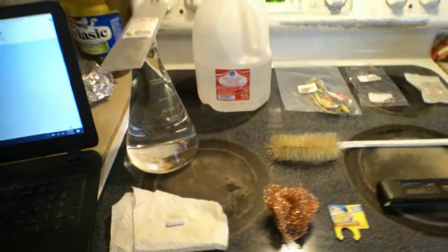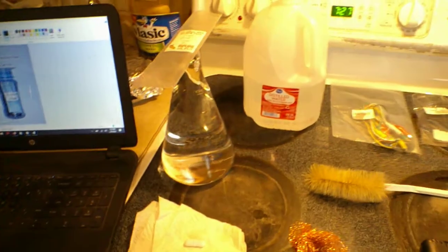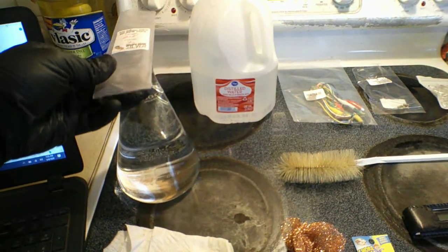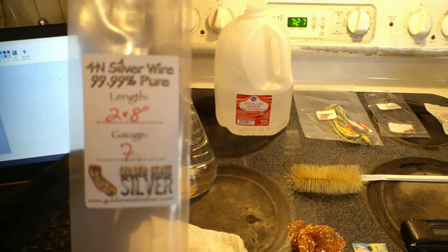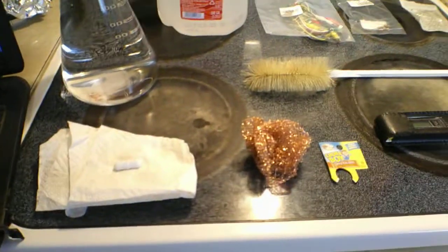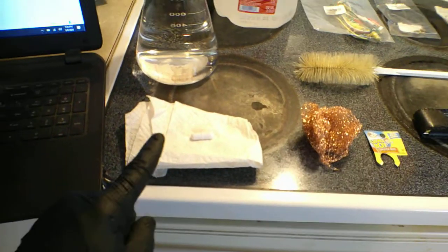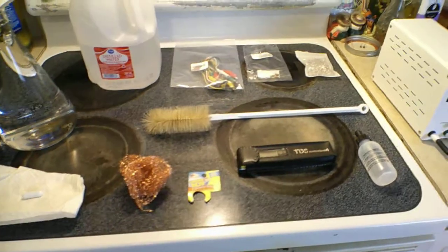To make your own homemade colloidal silver, I've made a couple of improvements. I've already cleaned out this beaker really well, rinsed it with distilled water, and it's filled with distilled water right now. On top is the package the silver rods came in — 99.99% pure. I'm going to put this on a stir plate to keep everything stirred while it's being made, and there's the stir bar that's been cleaned and rinsed with distilled water.